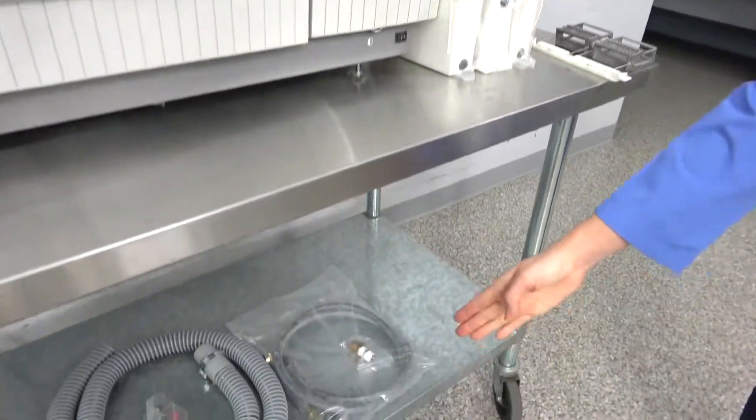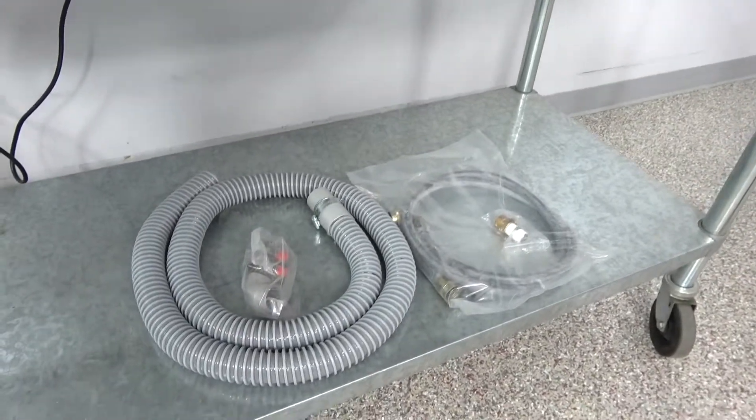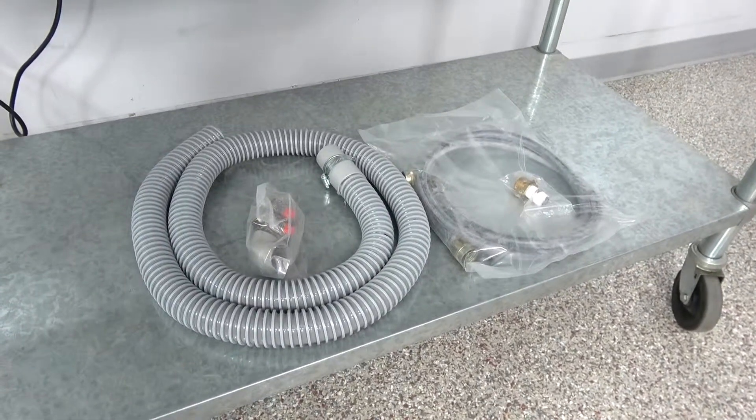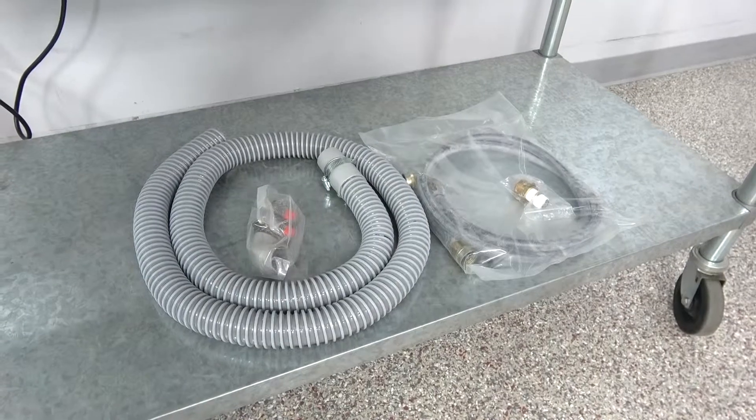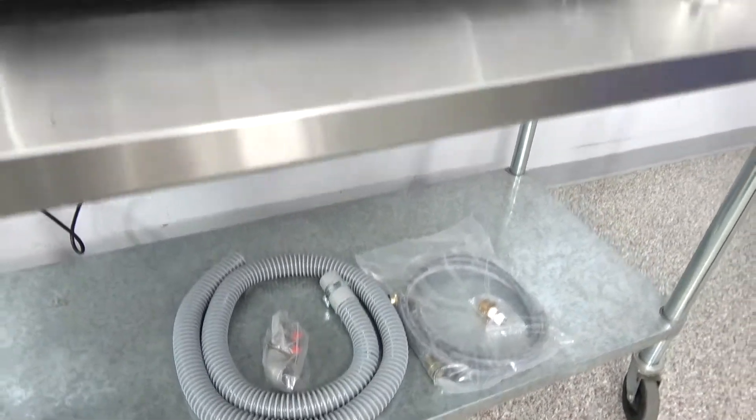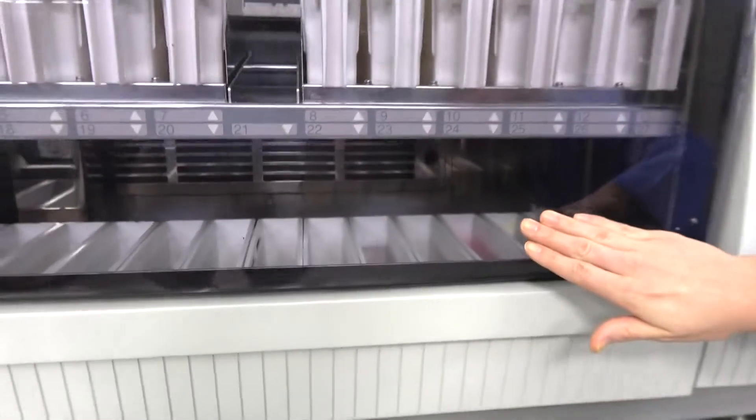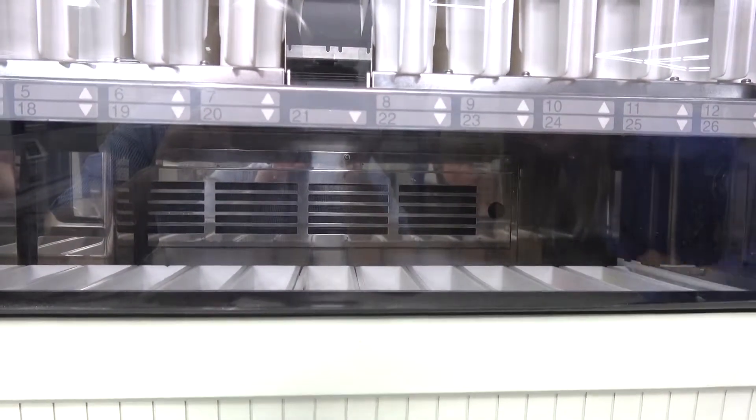So down here we have the waste lines as well. This is equipped with a carbon filter to get rid of your exhaust fumes. And you can see the carbon filter at the very back as well.